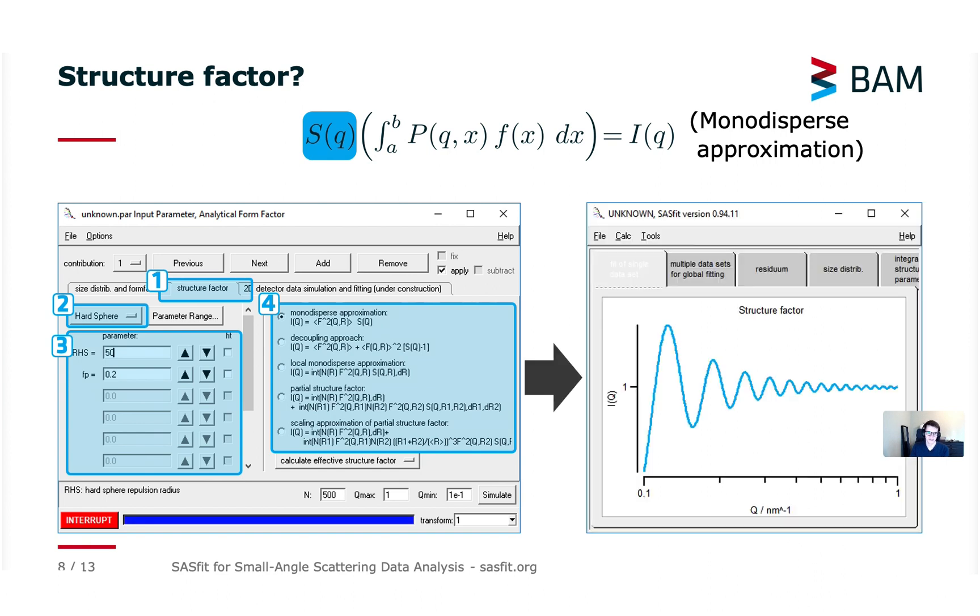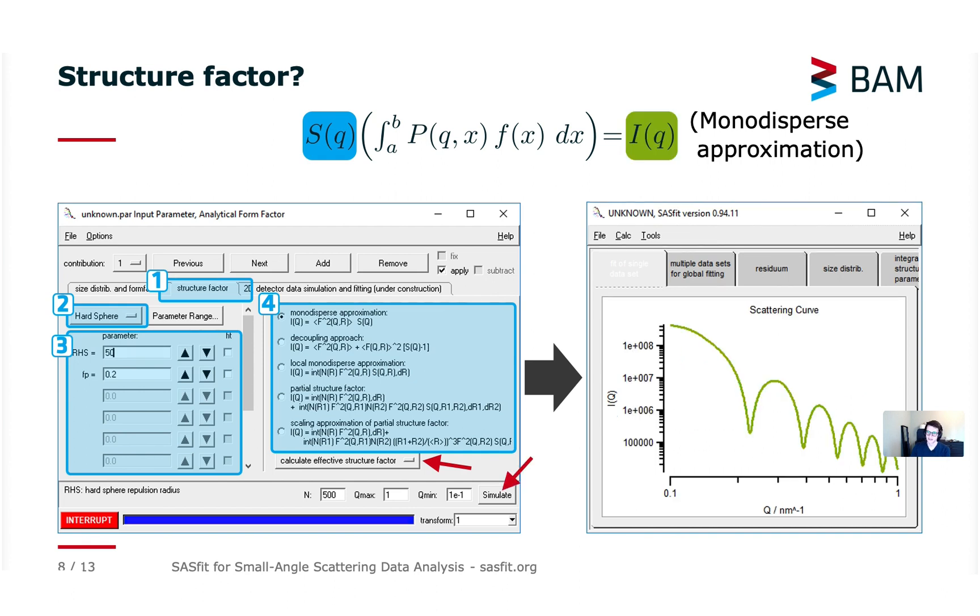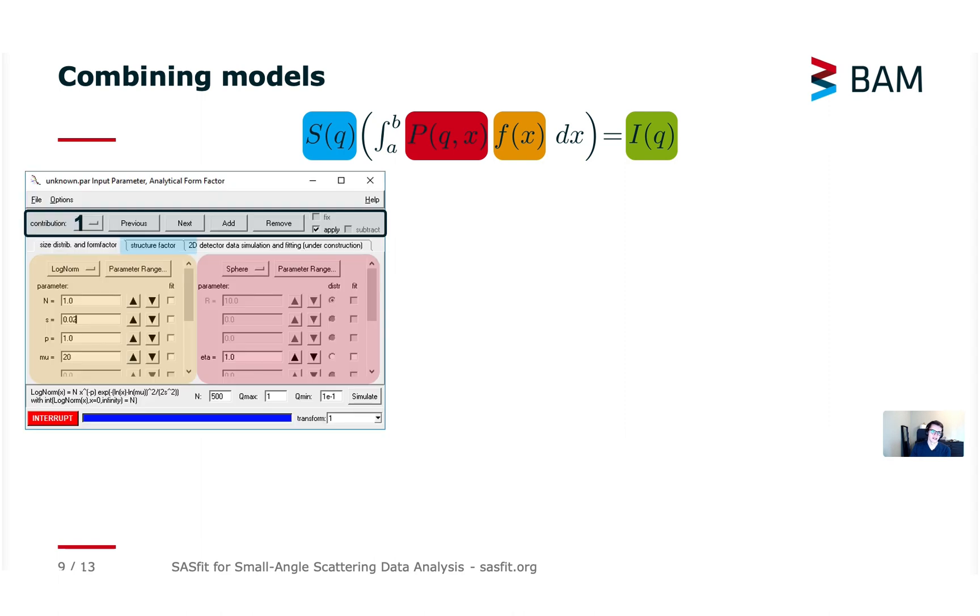So from here when the structure factor is configured I can easily plot the structure factor alone to have a quick overview of what the structure factor would look like. There's a button in the lower part there you can switch between plotting the structure factor alone or the actual intensity curve.